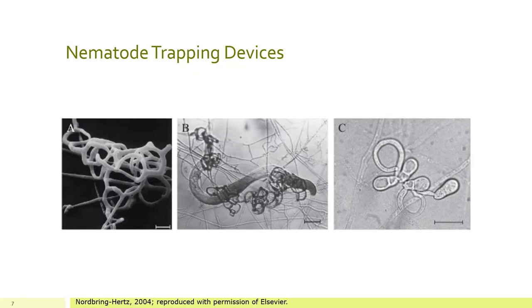And similarly to the spider's web, the fungus allows the nematode to crawl through it, it gets stuck, and then you see these concentric rings on the right-hand side here. Once the nematode goes through there, it gets trapped, tightened up, and it's slowly consumed from the inside out. So again, this goes to speak to the diversity that's in our soil and the complex system that we have.